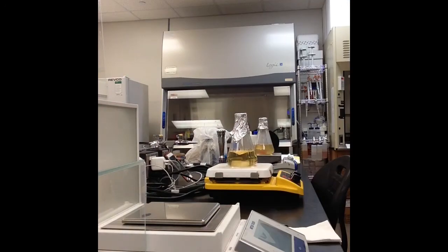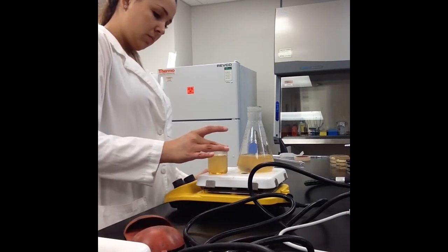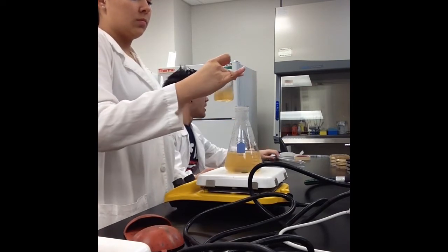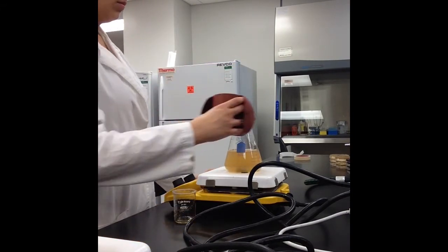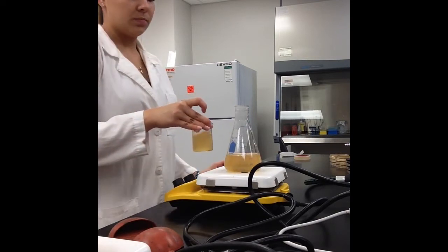As our Erlenmeyer flasks sat on the hot plates and stirred, we proceeded to add our different amounts of honey, agave, and molasses into the Erlenmeyer flasks. Viscosity is reduced as temperature increases. We placed the beaker onto the hot plate and stirred it with our solution in order to not have to add any more water. And then we poured the leftovers of the beaker into the Erlenmeyer flask to make sure that all of our materials were being used at the appropriate concentration.